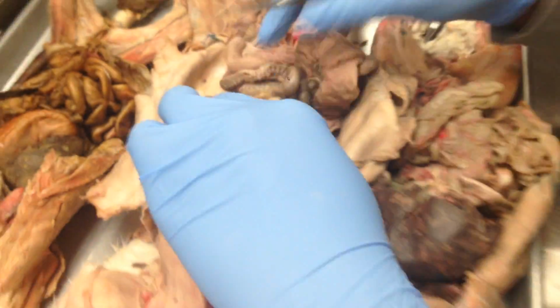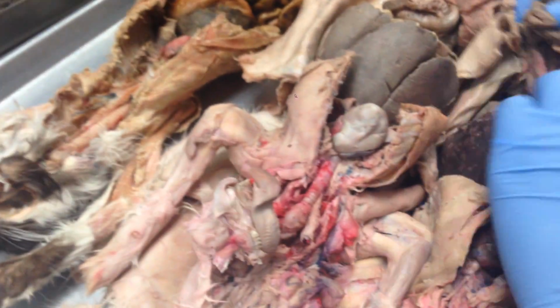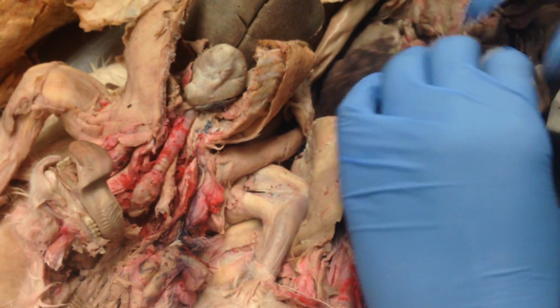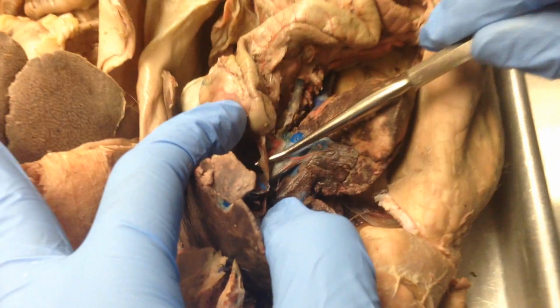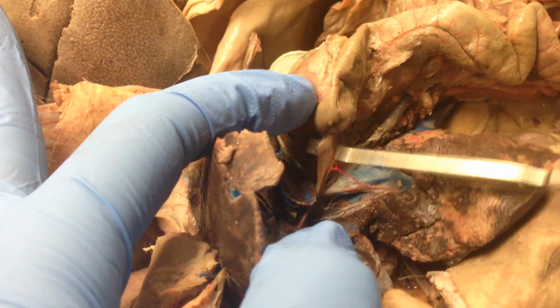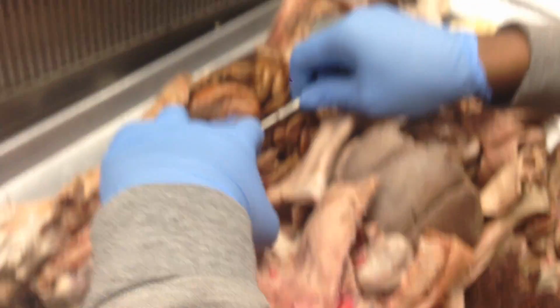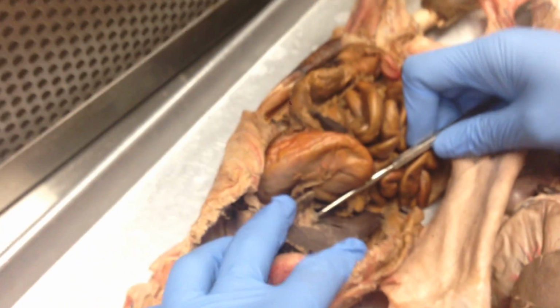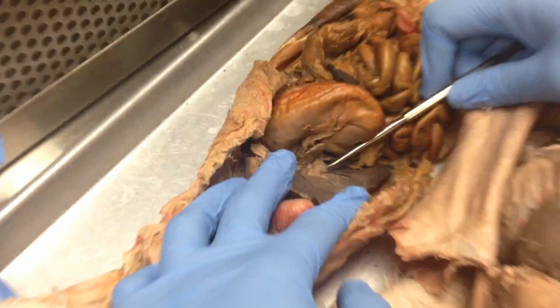And then the common bile duct. It leads straight to the duodenum. A better view would be right here. That's the common bile duct, leading straight to the duodenum. And then the cystic duct, which is supposed to be seen in the cat. It comes off the gallbladder, so it would be this right here.